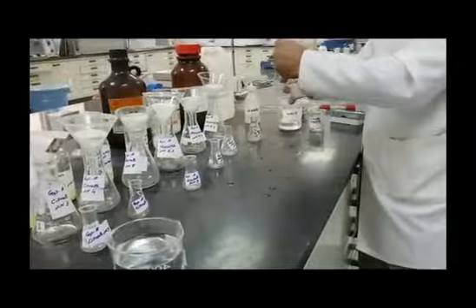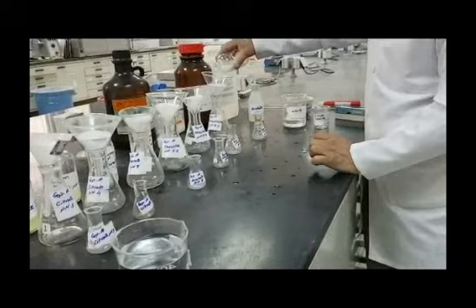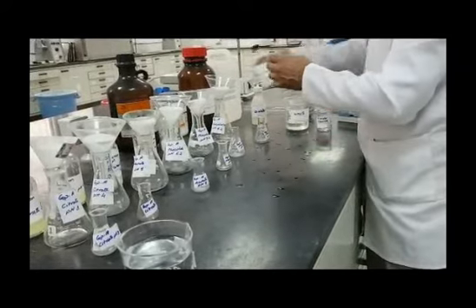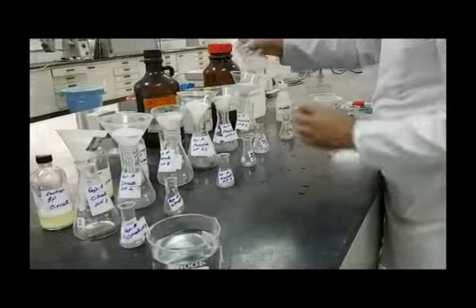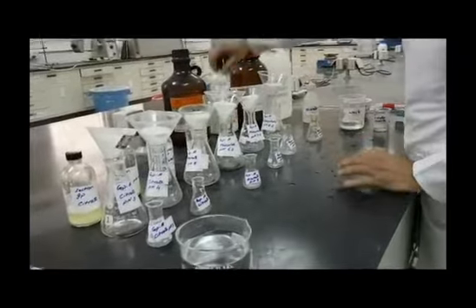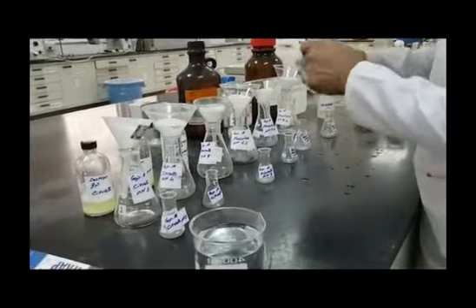Now start pouring a small amount from the tested solution in the glass bottles into the specified gravity filtration assembly as labeled. Here we have to discard the first portion of each filtrate.